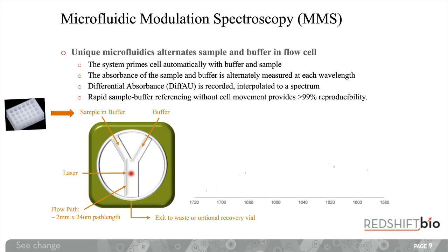To make our measurements, instead of using two matched cells as described for Fourier transform infrared spectroscopy, we instead use just one microfluidic flow cell. This has one measurement chamber, but two inlets, one for sample in its background and one just for the background itself. And I should note that the background does not just need to be your buffer, as is shown on this diagram, but could also contain some other components if you wish to study the secondary structure of your material in the presence of the other. As what we are doing here is we are taking the differential spectrum between whatever solutions are within channel 1 and channel 2.